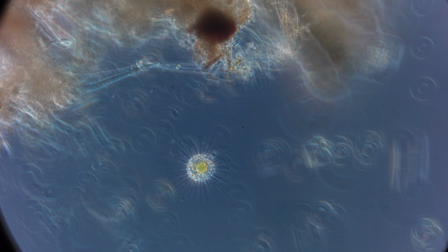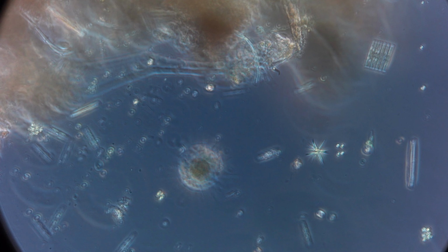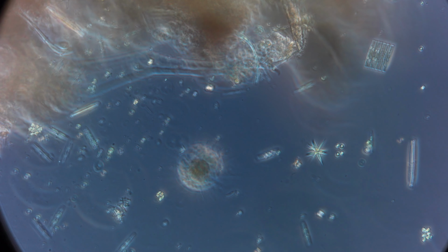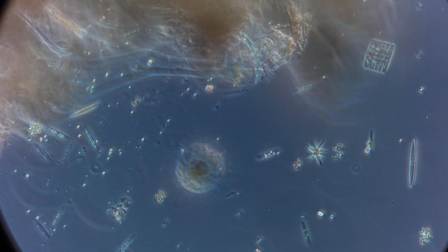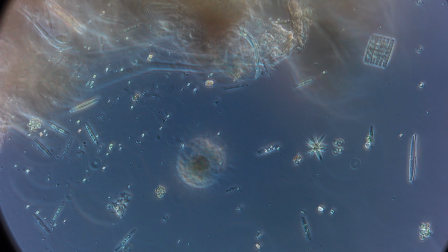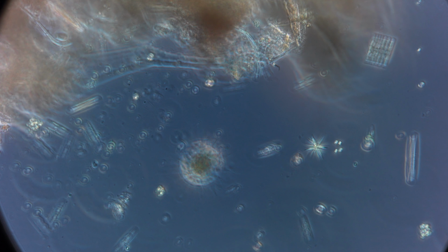So it looks like maybe he's catching some bacteria. Sometimes you can see the bacteria. They're little dots. Like these are bacteria. And bacteria are considered plankton too. Ooh, that's kind of cool. I forget what those are called.